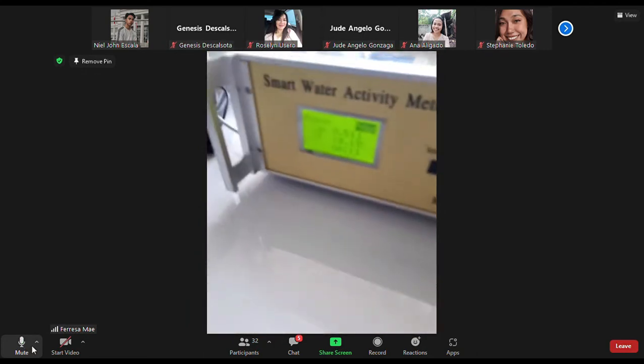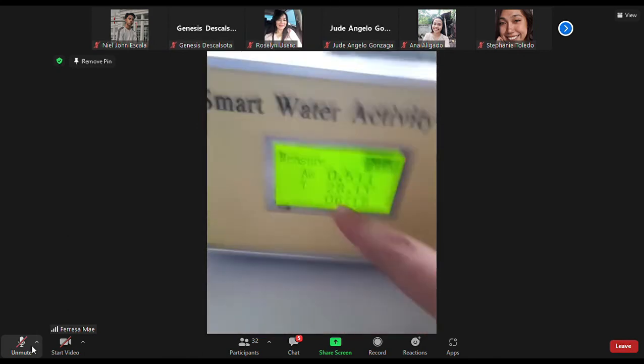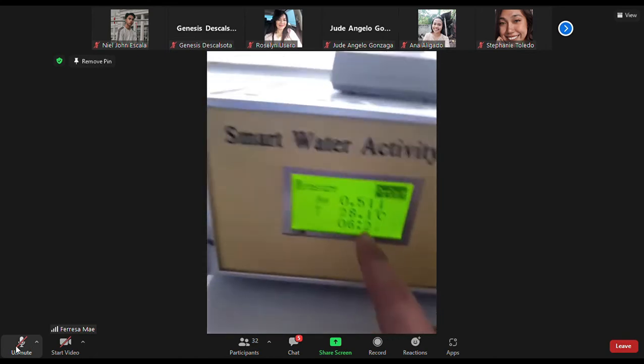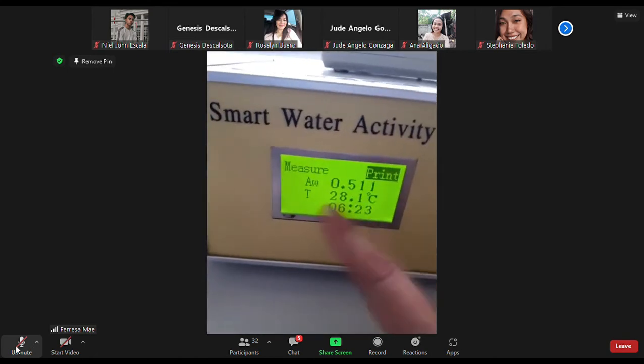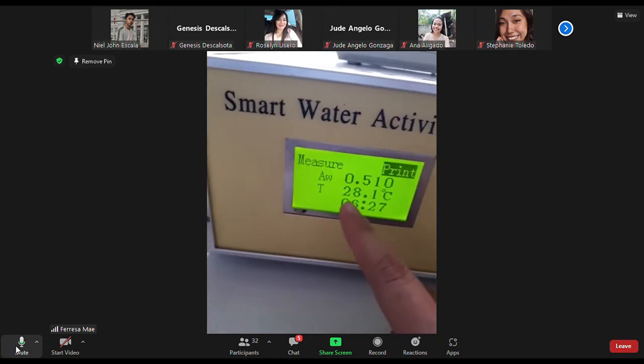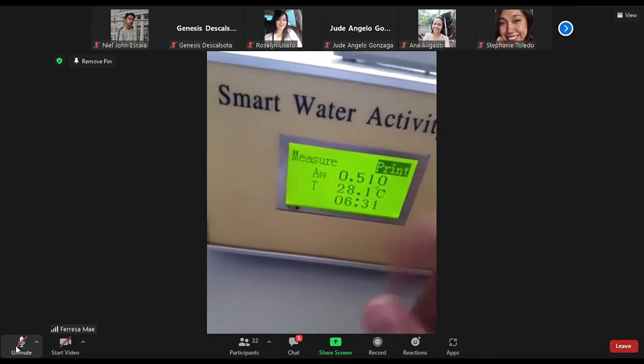27. Pero it doesn't matter man ang temperature kay ang aton man kwaon is ang water activity. So ang result na karon ang water activity man ang aton nga kwaon. Pero ginaano ya lang ang temperature para ang aton nga concern na is the water activity.